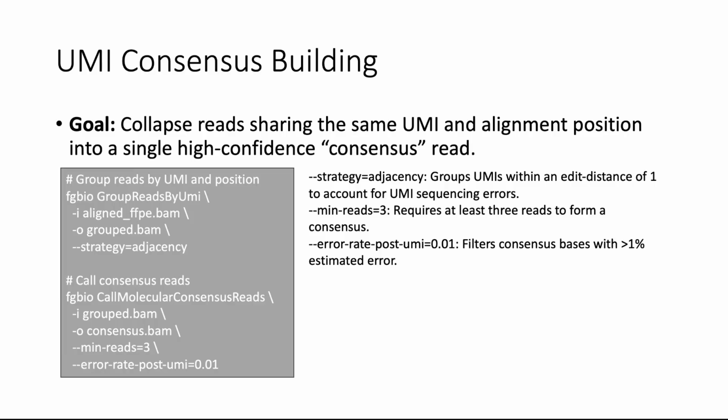We are always working with different options and configurations in our tools, which could be adjusted to a certain sample type or initial data quality or specific library preparation kits and so on. So for example, we're able to correct how accurate UMI reads are, and if there is one error in the UMI region, they are still able to be connected together and used in this deduplication stage.